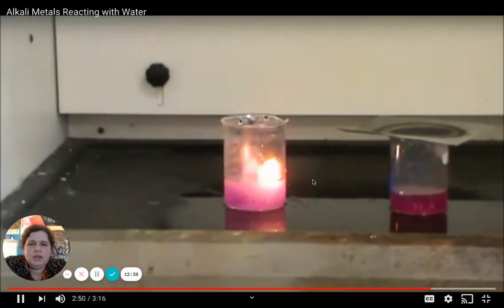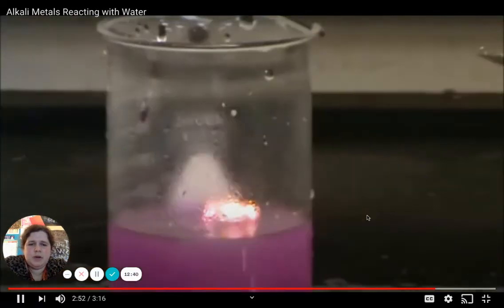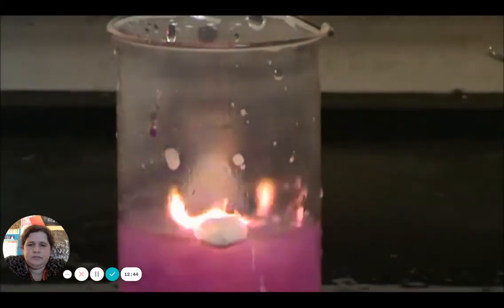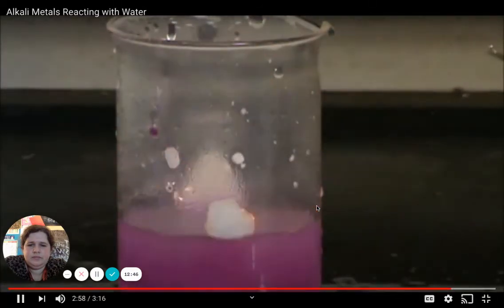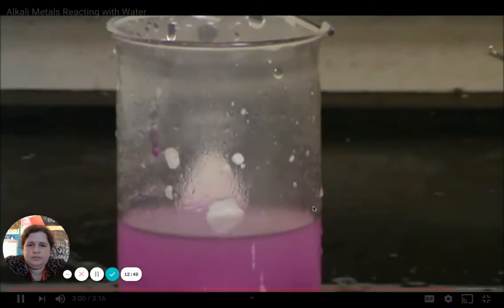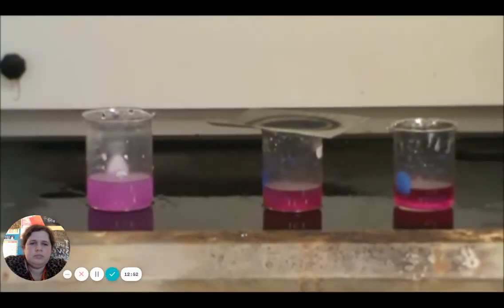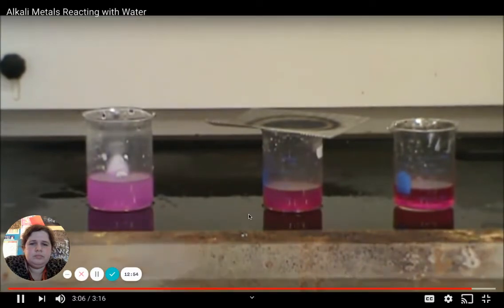So you can see that each of those three is very reactive with water. All three produce hydrogen gas. All three produce hydroxides. There's your alkali metals. Next, we're going to go ahead and... Okay, so we're going to stop right there.